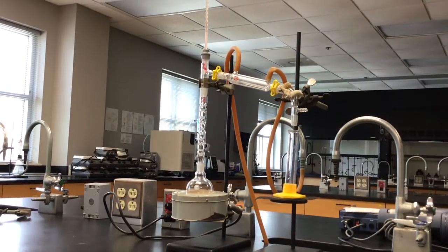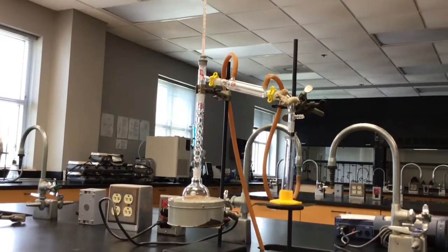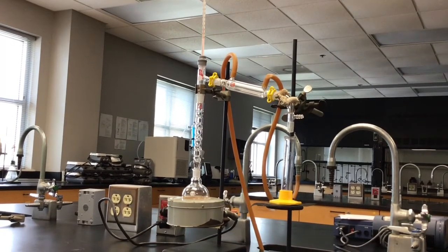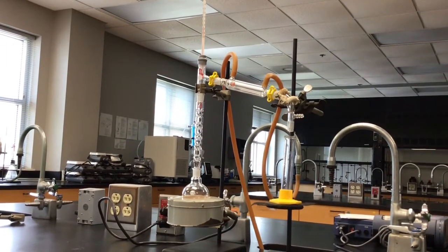Alright, so this week in Organic Lab, you're going to be performing simple and fractional distillation so that you can separate a mixture of two compounds with differing boiling points.